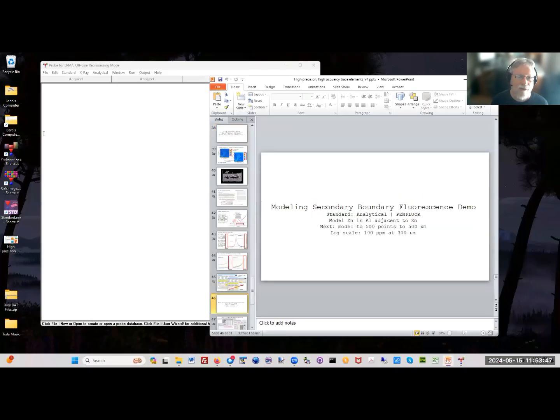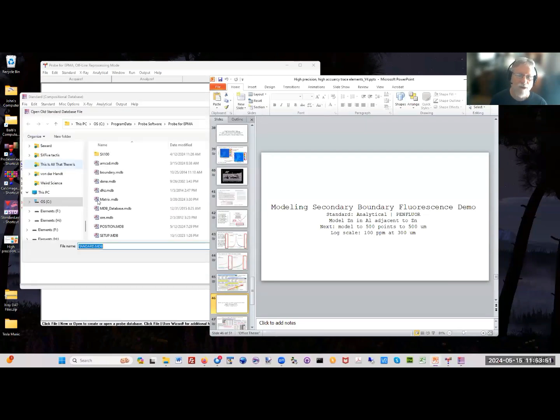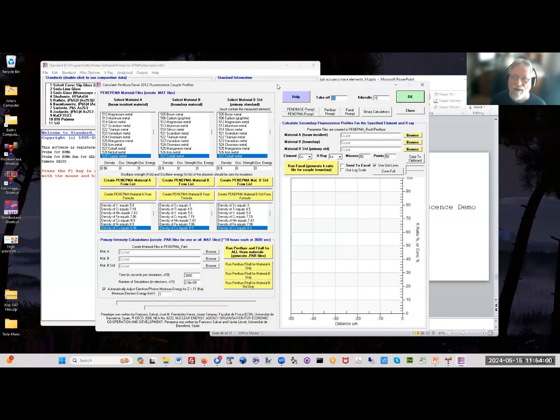Okay, so let me just run this really quick. This standard software, by the way, is free. You can download it from CalcZAF right now, and it's available online at a number of different locations. Let me know if you can't find it.